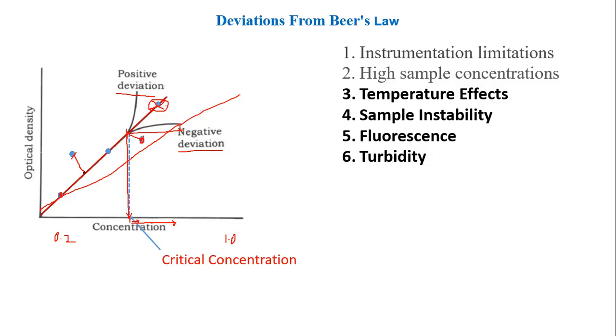Yes, sir. Okay. So you should always choose those points so that you get a balanced curve, rather than choosing those points which give you a lopsided curve. Imagine that this is the curve that I have drawn, taking these 2 points. Then these 2 points both are positive deviations, right? So that will add to the extent of error that I'm getting. Am I making the point clear?